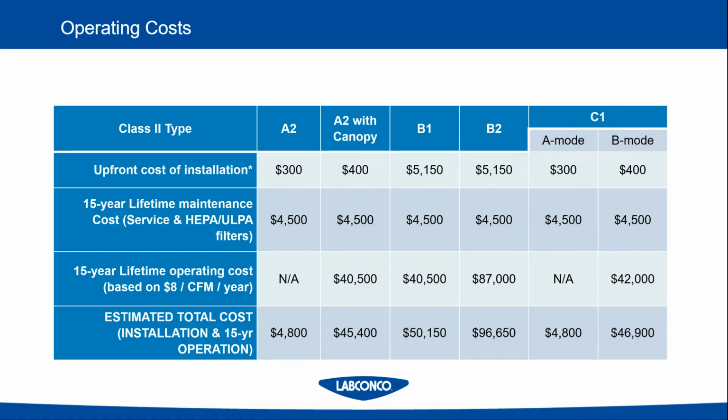Laboratory air is expensive. It has to be conditioned correctly before it enters a lab, to the correct temperature, to make sure the researchers and the experiments can be conducted safely. And it also usually is a single pass through the building. So it's pretty expensive to run a building's exhaust system for a lab.